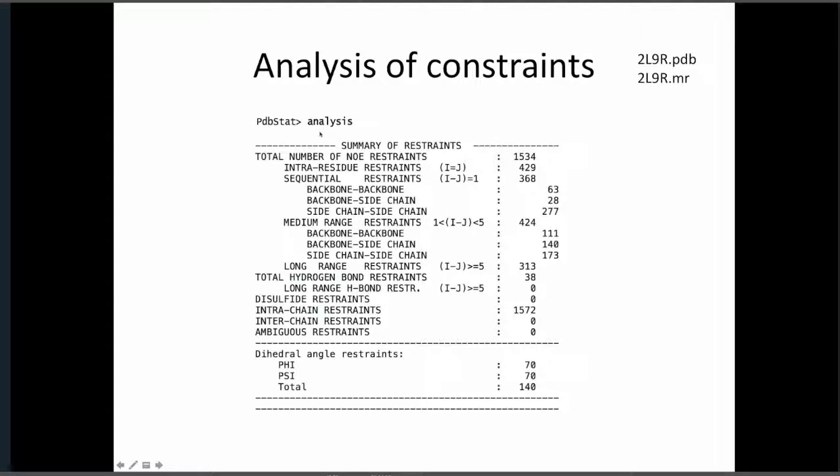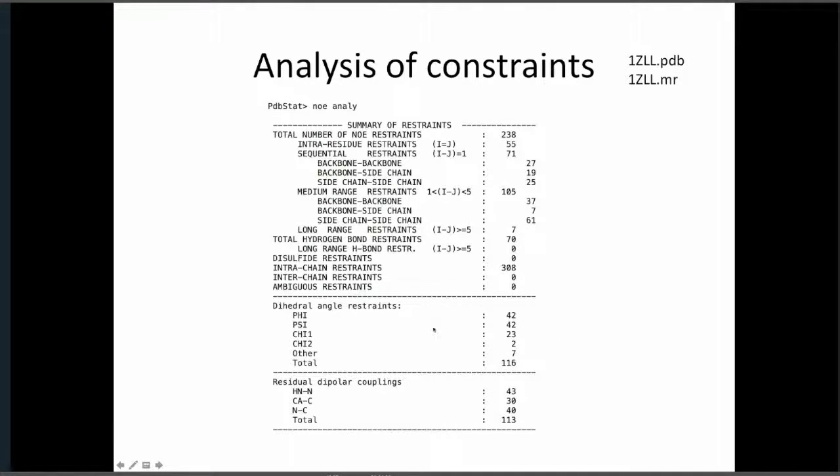So it will provide you with this, whatever is in the memory, it will classify either the distance restraints, if they are ambiguous restraints, or the dihedral angle restraints for this example, or for this other example. So you see, as more and more constraints are present in the file, it will keep adding fields with all the classifications. I hope I am explaining myself right.